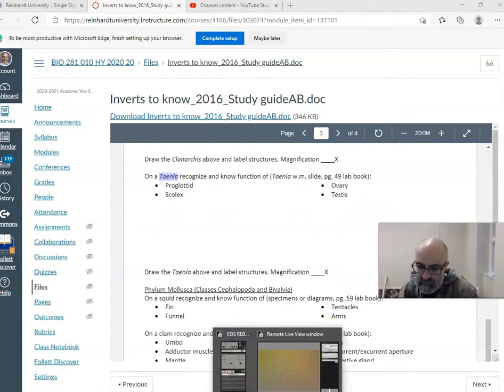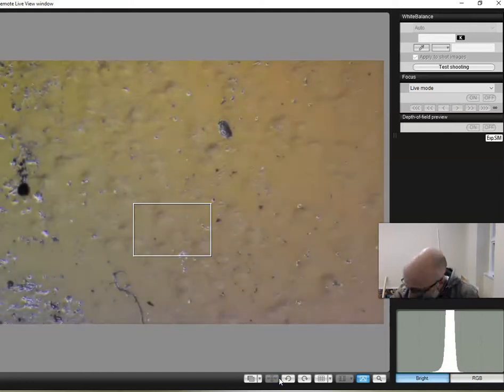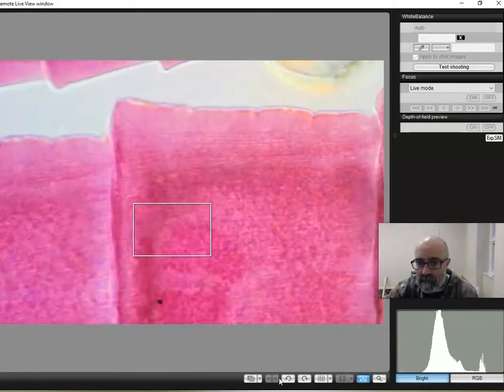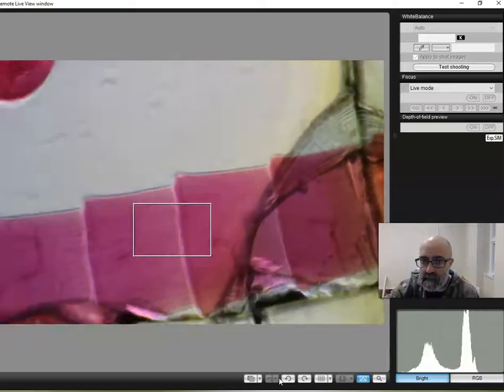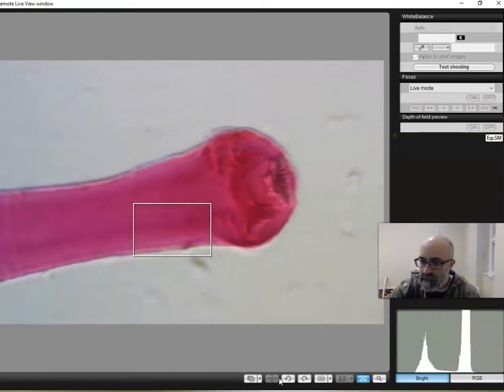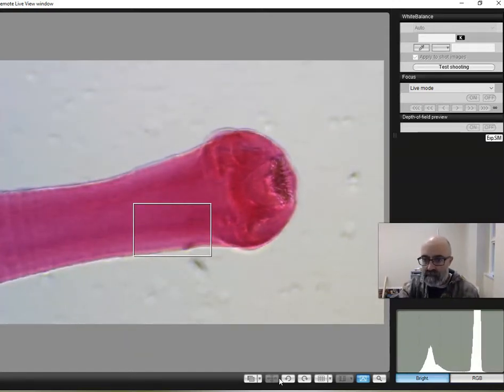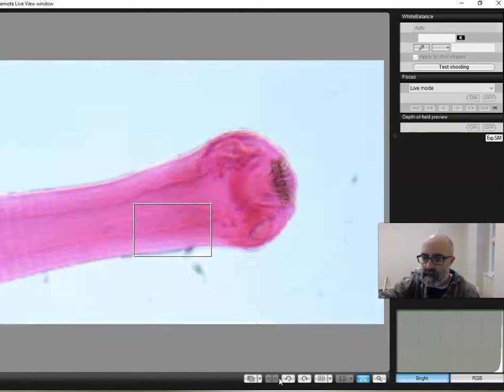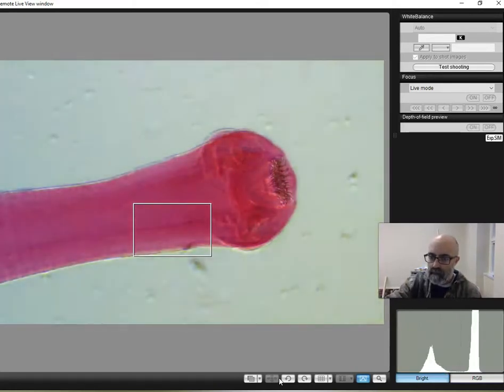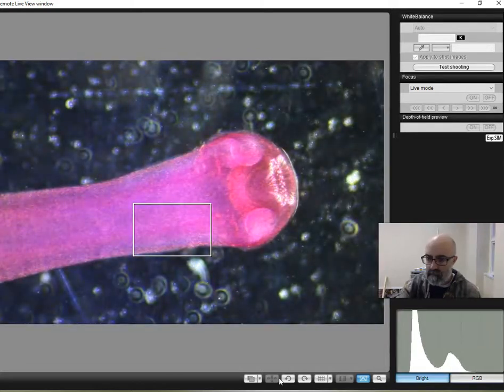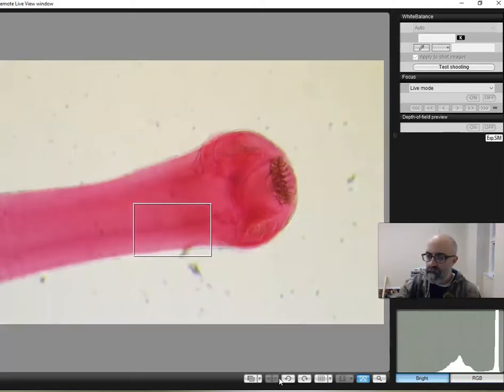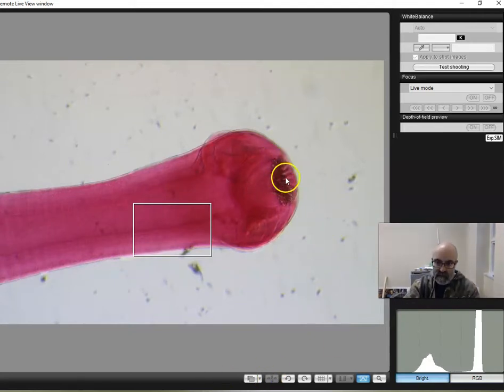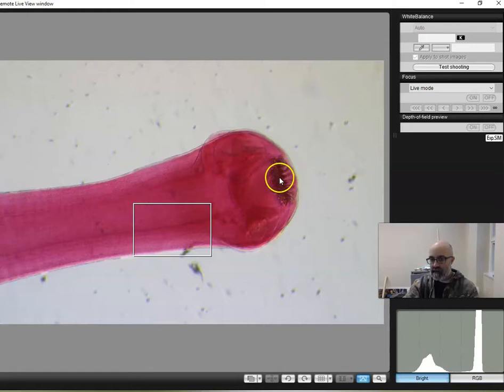So if we put this on to our scope here. And now we're going to go to the smallest. This is the very front end of this organism. So here's the front end. The mouth. Don't look for a mouth here. This organism does not have a digestive system. It lives in a digestive system. It doesn't need to digest things. You digest for it. It absorbs.